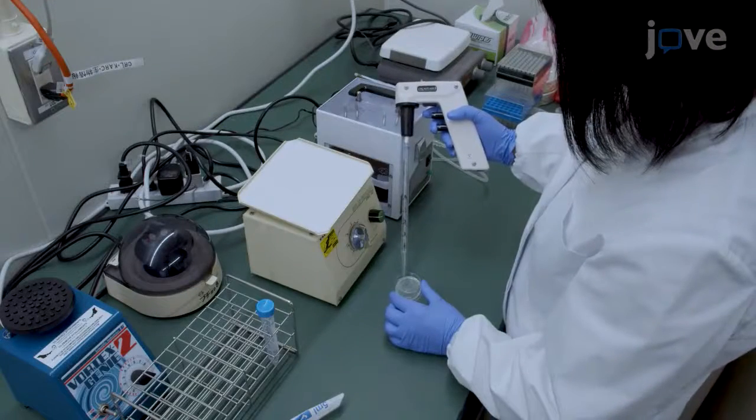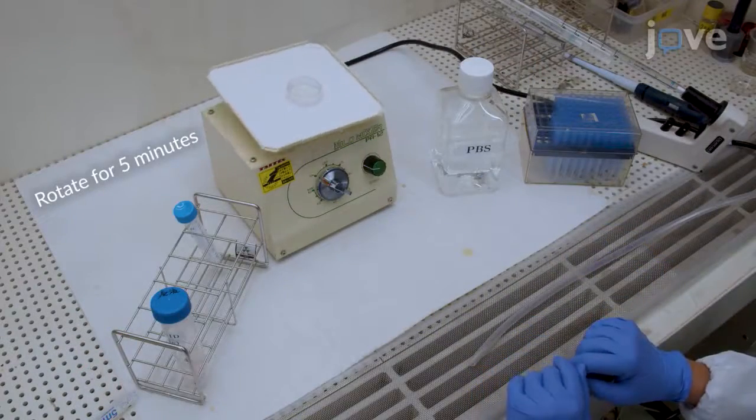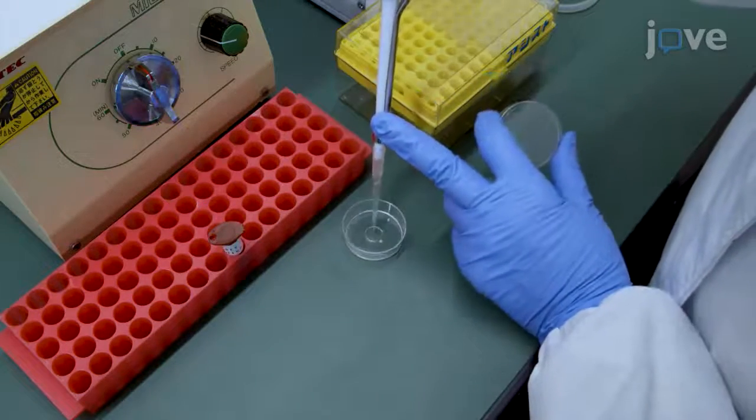Permeabilize them with 2 milliliters of 0.1% Triton X100 in PBS while rotating, and repeat the washes with PBS. Then stain the cells using a standard antibody staining protocol as described in the text manuscript.